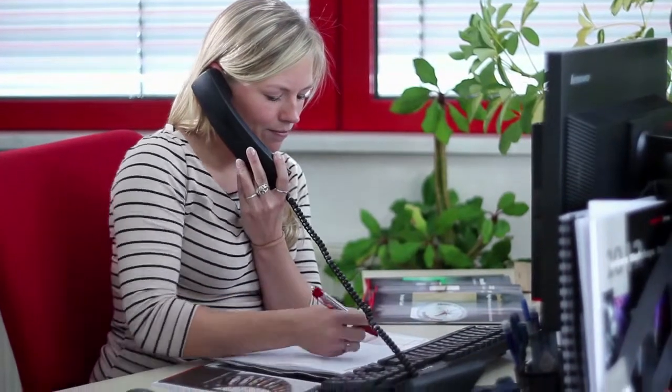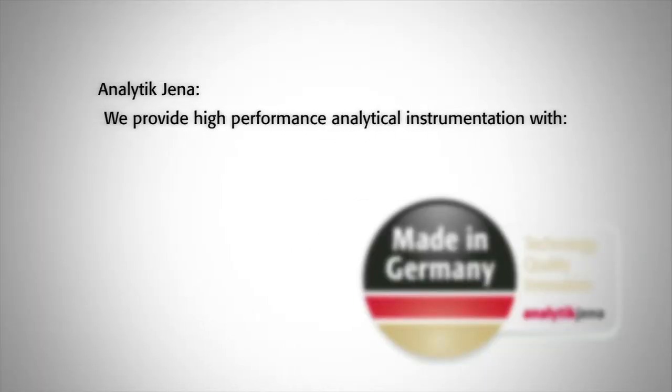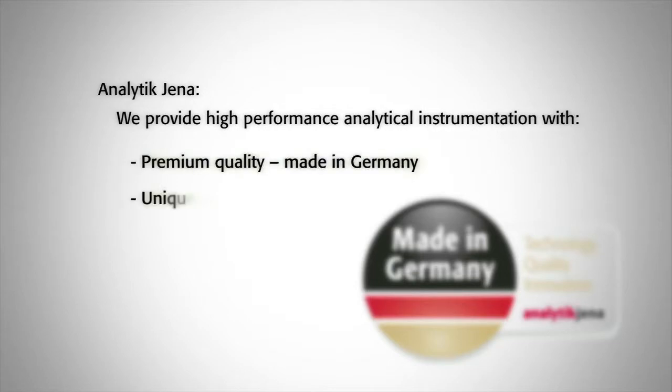Analytik Jena's core competencies are in atomic absorption and molecular spectrometry as well as sum parameter and elemental analysis. We provide high performance analytical instrumentation with premium quality made in Germany, unique precision, high-end technology, and durability.